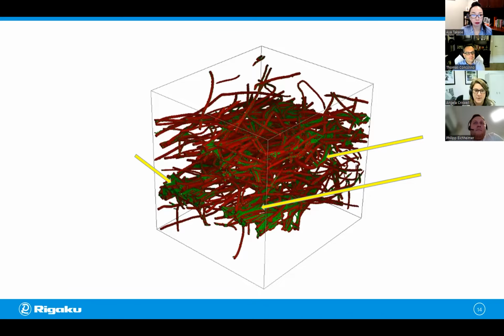And again, back to another poll question. I guess you're going to explain it, but we'll ask the audience first. So this one is a true or false question. And the statement goes, binder is added to filter media to improve mechanical strength, to enhance filtration of contaminants, and to reduce flammability. Is that true or false?